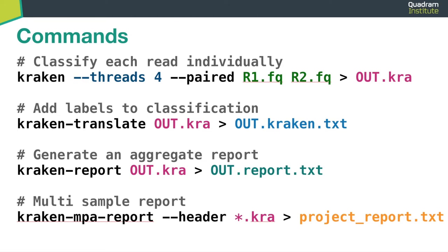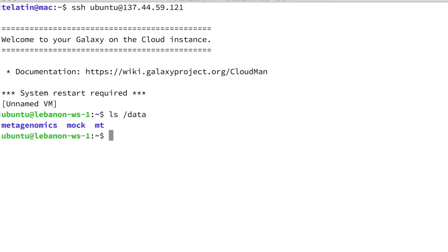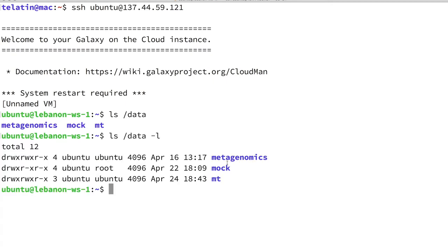Here are the commands we are going to use. As usual, we can log into our machine. We mentioned several datasets. Where can we find those datasets? They are all in the /data directory. In particular, we have MT for Mycobacterium tuberculosis, mock containing the two mock communities — the simulated one and the real one — and finally, metagenomics containing the environmental samples. Let's start by looking at the content of the MT directory.